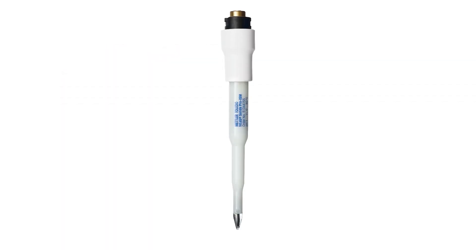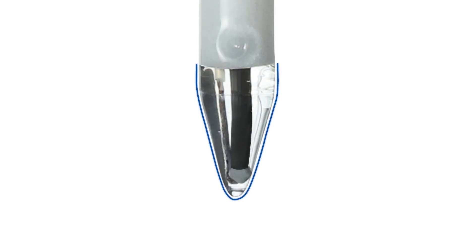This electrode has a spear-shaped tip made of thick, toughened glass that allows direct insertion into the food samples. This spear-shaped pH-sensitive membrane is made of LOT glass, which has a low resistance, which helps in fast results.